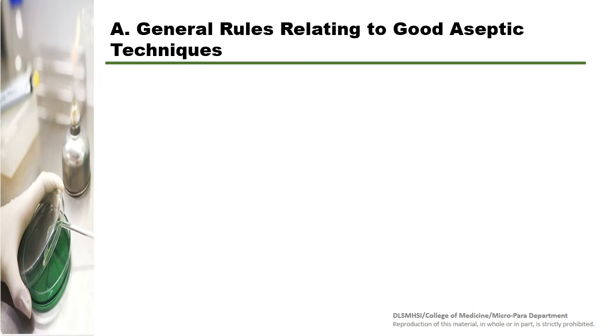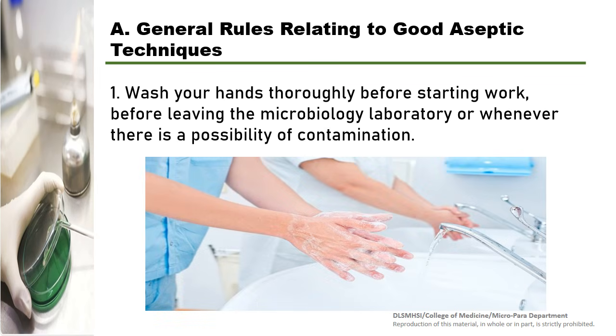First, we have the hand washing. Whether you wear your gloves or not, you should always wash your hands thoroughly before and after your work or whenever there is a possibility of contamination.